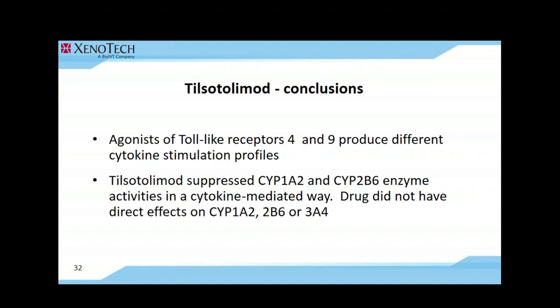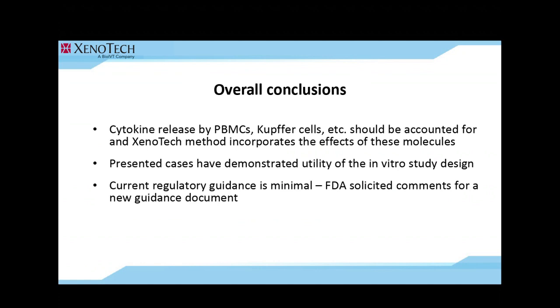Therefore, our conclusions combined from the 3 cases we presented are that cytokine release by PBMCs, Kupffer cells, and others should be accounted for in the evaluation of DDI potential of therapeutic proteins, and the Sekisui XenoTech method incorporates the effects of these molecules in its design. The presented cases have demonstrated the utility of the in vitro study design.